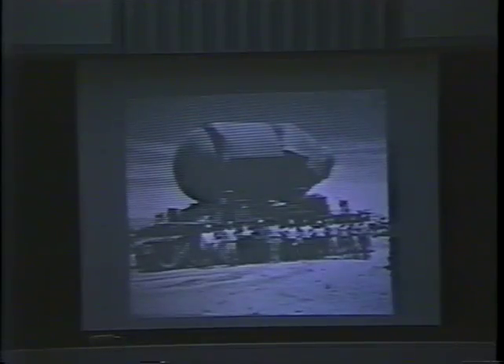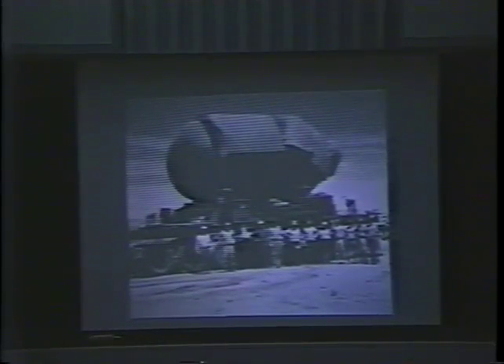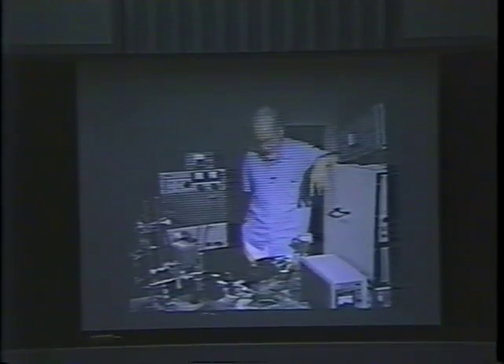The Los Alamos Scientific Laboratory in New Mexico, during World War II, the home of the Manhattan Project and creation of the atomic bomb. Los Alamos was also the seemingly unlikely birthplace some years later of the cell sorter. A key player in its development was Marvin Van Dilla, a young physicist at the time who remembers the role biomedicine played at Los Alamos. The Manhattan Project was set up in the 40s, 41 actually.